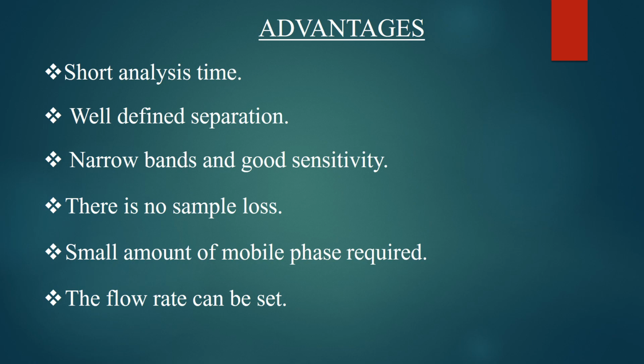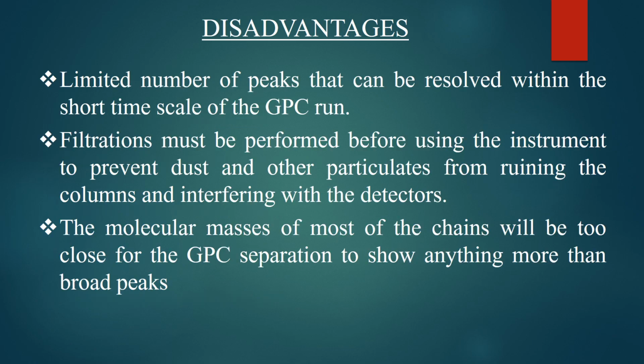Now comes the advantages. Short analysis time, well-defined separation, narrow bands and good sensitivity. There is no sample loss. Small amount of mobile phase required. The flow rate can be set.